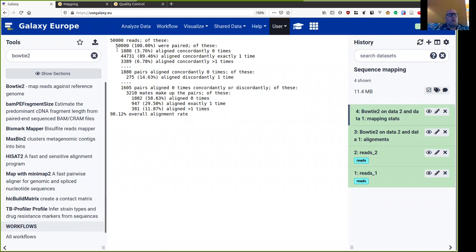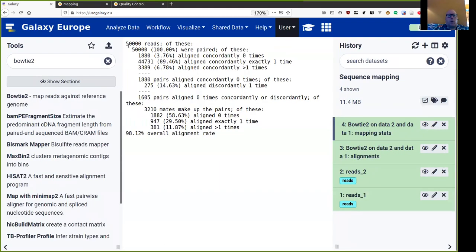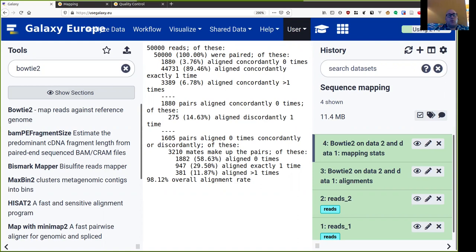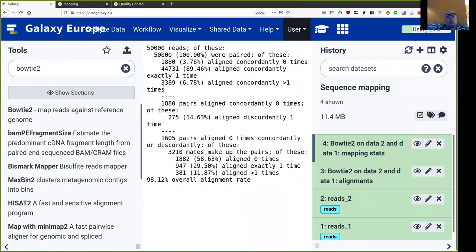So as we know, our reads are all paired. In this case, we only have 50,000 reads. It's a really small number these days. And then 1,880 of those did not map. And then 3,389 mapped in multiple sites. So when we look at these two numbers, then the reads that did not map and the reads that mapped multiple sites tell us something about our data.